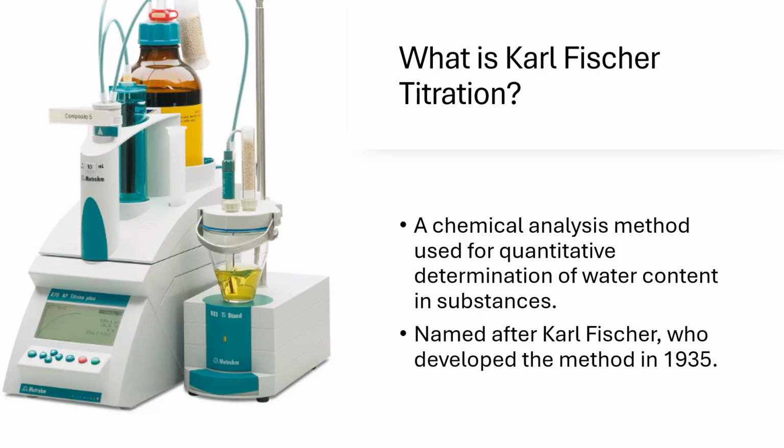It's named after Karl Fischer, the scientist who developed this method way back in 1935. Even today, his technique is used for moisture analysis because of its accuracy, specificity, and suitability for a wide range of materials.